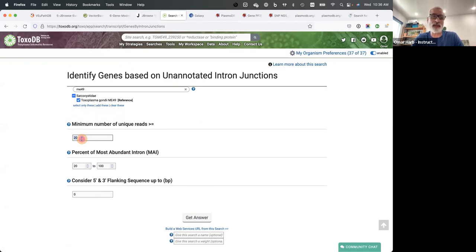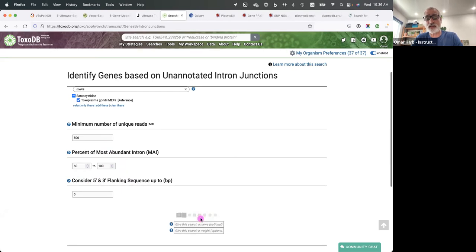And so, for example, I can say, well, I really want something that has strong support. So I want to pick something that has at least, I'm just going to randomly pick 500 reads. The answer may be 0, as I mentioned to you yesterday, you can get an answer of 0. And I'm going to say, I want it to be between 60 to 100% of the most highly abundant intron for the gene that's returned, okay? And so then you can run this search.